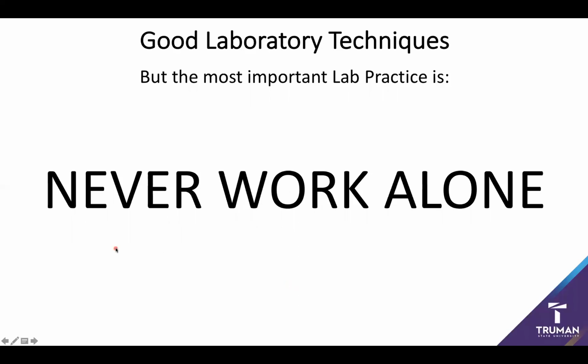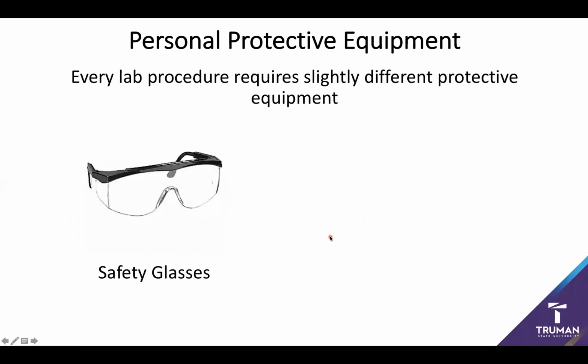Even if you are just coming into the lab to move over a column or end a distillation, make sure you have somebody with you, just so that they can go for help in case something does happen. No matter how simple the procedure is, the lab is an inherently dangerous place. So always make sure that someone at least knows where you are and that you have someone there for backup. And we'll talk more about this later.